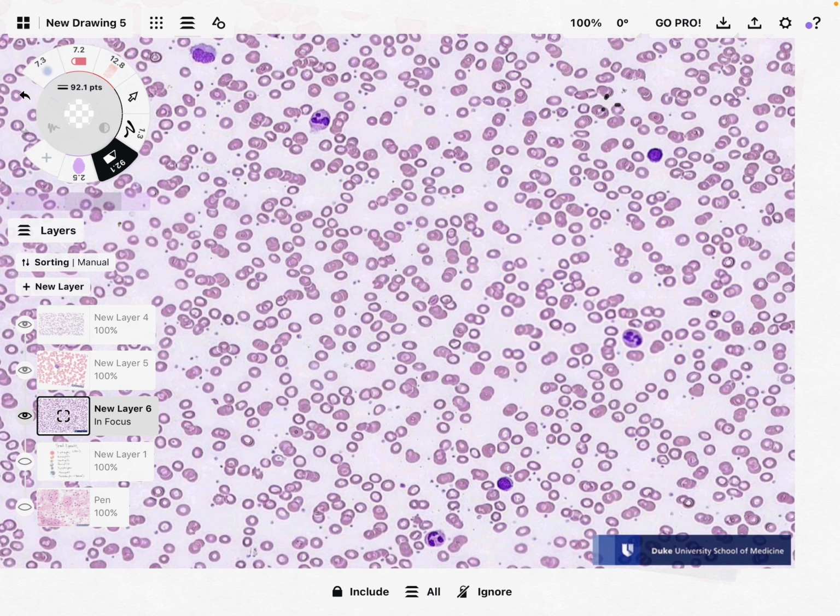But as you start to zoom into, say, maybe 20 times magnification, you'll start to see dark purple looking things among this sea of pink roundish cells. And again, recall that most of the formed elements of blood are erythrocytes, these red blood cells. So they are 99.9% of the cells you're seeing. But as you start to zoom in, you're going to start to see some nuclei that are being stained by the hematoxylin. So you can actually start to see some purple things.